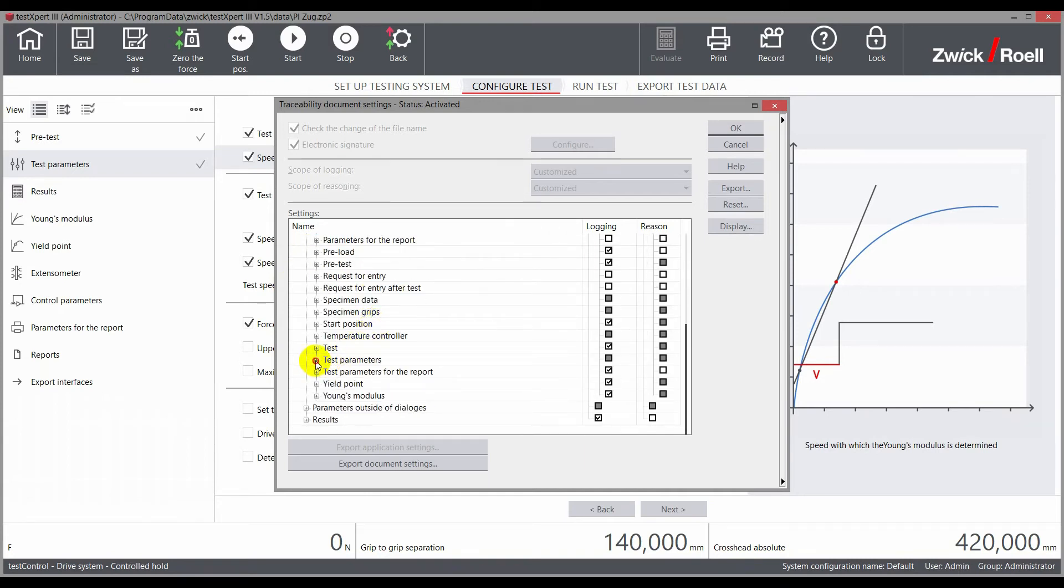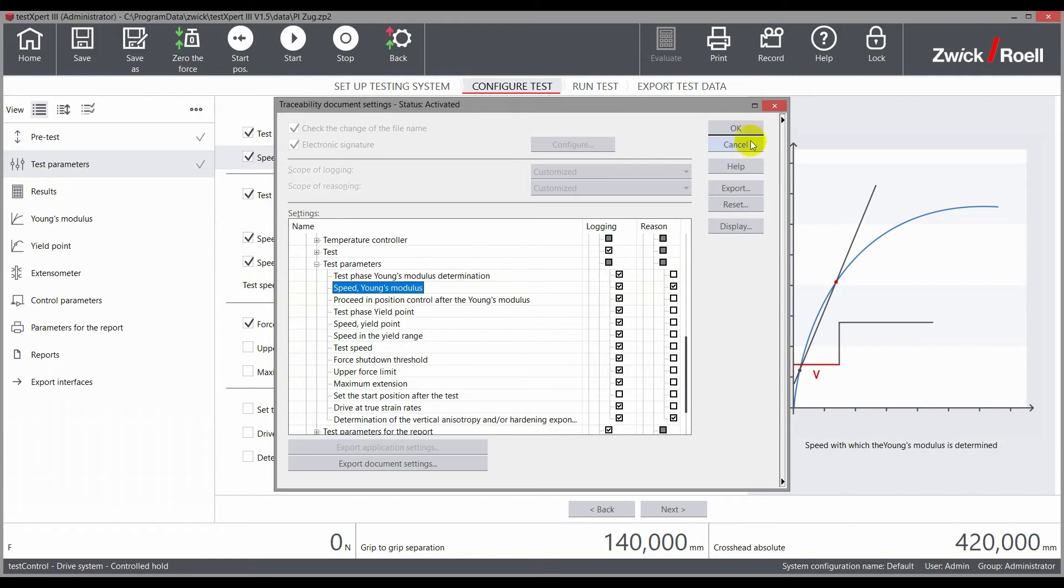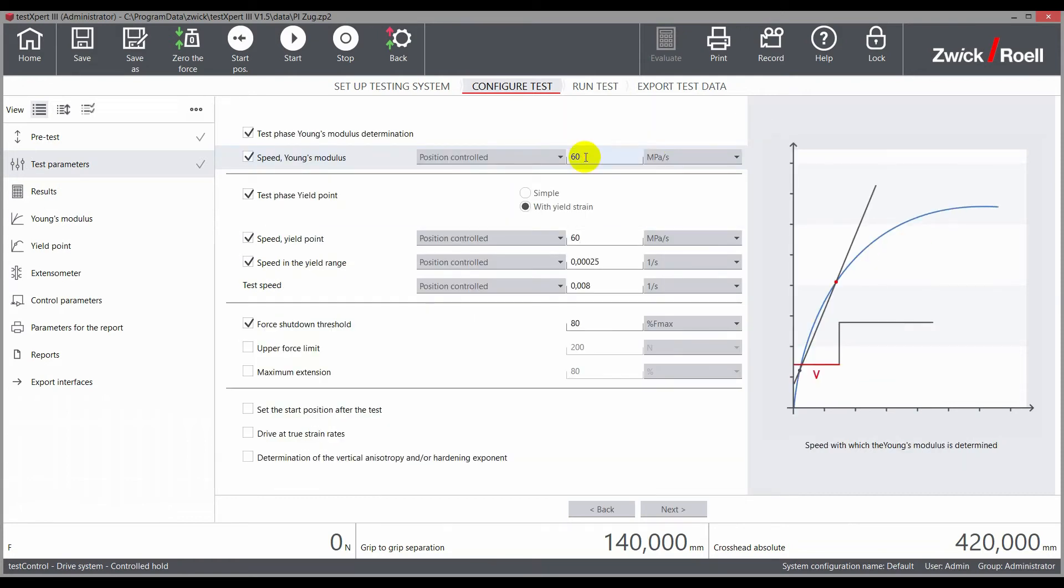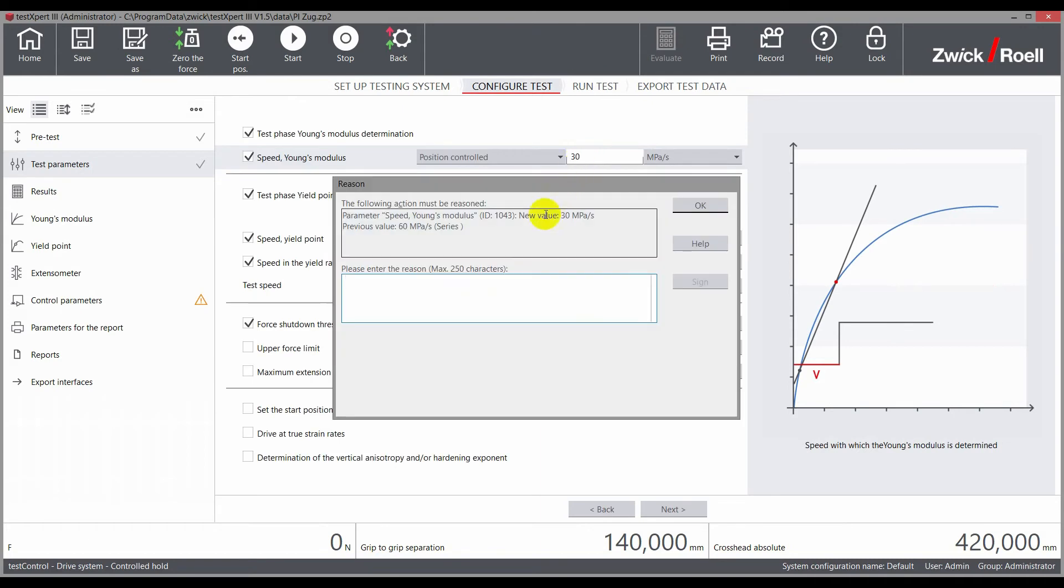If, for example, the speed with which the Young's modulus is to be determined is of particular importance, a reason must be provided for every change to this parameter to guarantee traceability. Here, the Young's modulus speed is adjusted from 60 MPas to 30 MPas, and the user must provide a reason for this change.